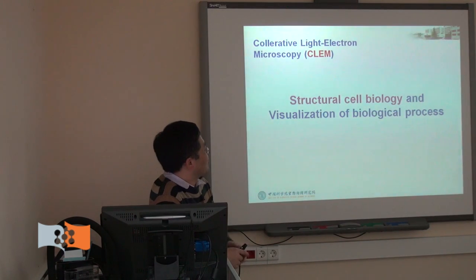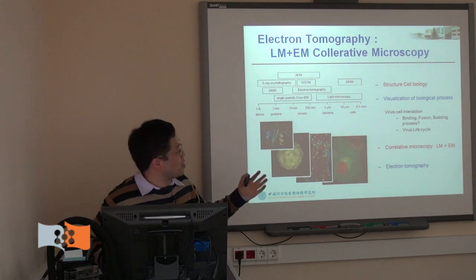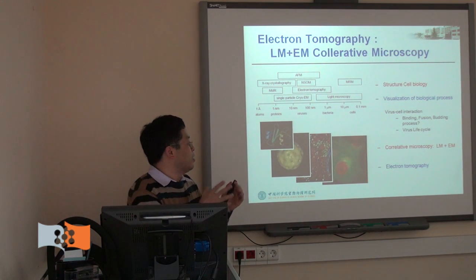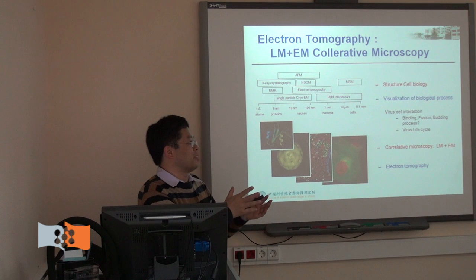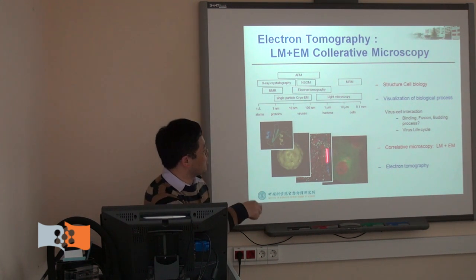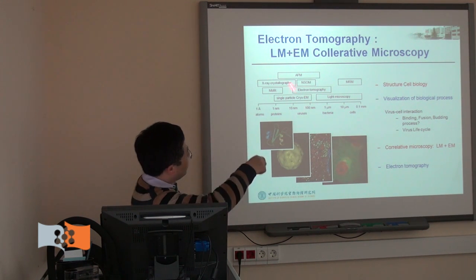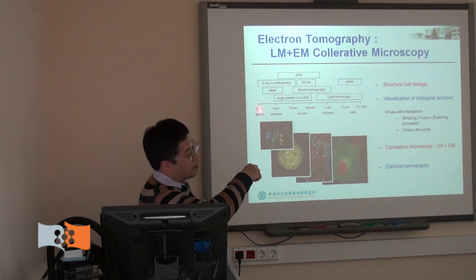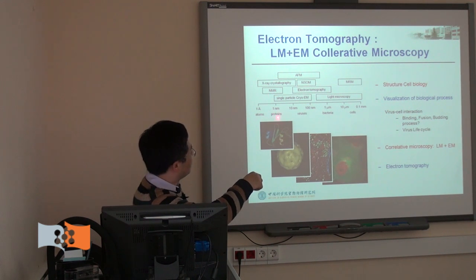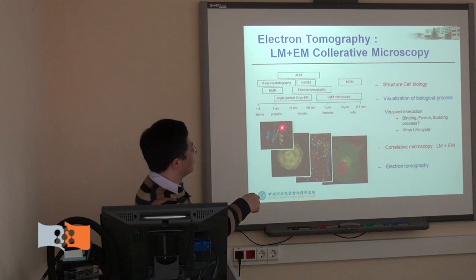Finally, I will give one more example. People are thinking you got the structure in vitro, so how about in vivo? I showed this slide before. We use correlative microscopy. There's high resolution, either in crystal structure or single particle structure, at atomic resolution. And this is light microscopy.